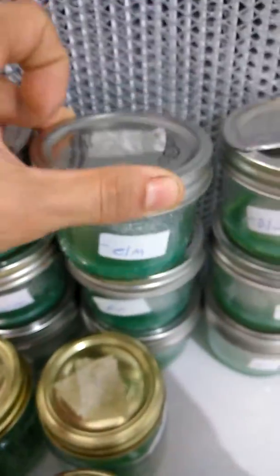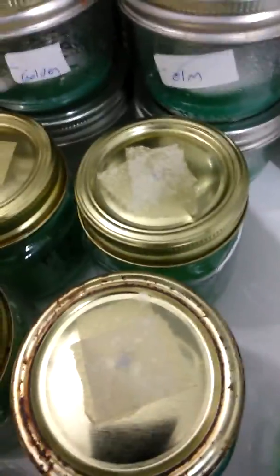Some of these are contaminated, like the elm here. So we're going to transfer off of this, and we'll put a little mark on the next jar so we know not to use that one for any liquid culture or anything, because we know that there was contaminated mycelium on there.